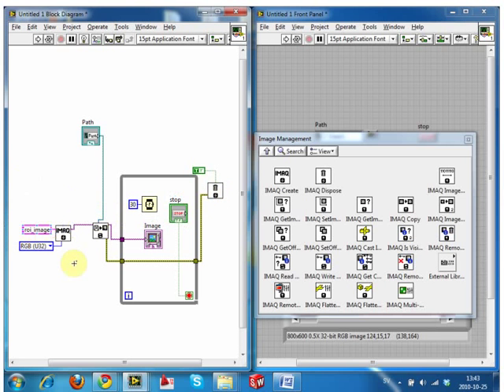Yeah, go ahead. I'm thinking, if you don't connect it to that point, but to the exit somewhere. Say that again. The yellow line. If you don't connect it to there. To here. Yes, but somewhere else, like outside of, after the loop.